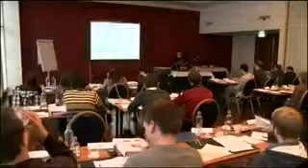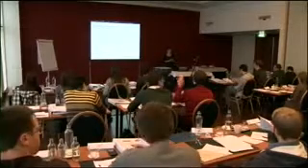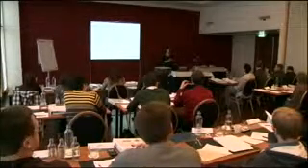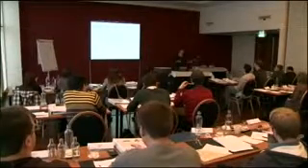And that's the end. So, any questions on microscopy before we finish? Yes? You explained the mechanisms of the characteristic X-rays. I wonder, why is that signal going to occur lower? It doesn't occur lower, it just occurs through a bigger volume.